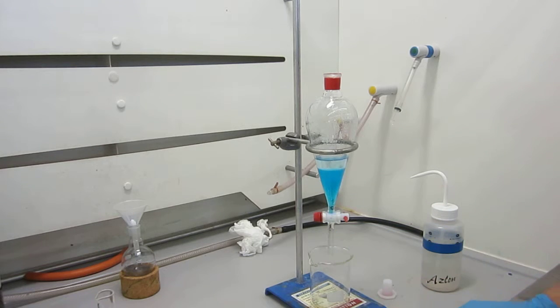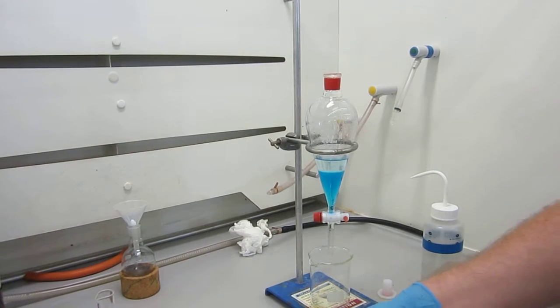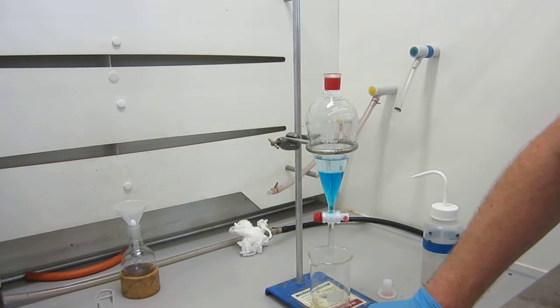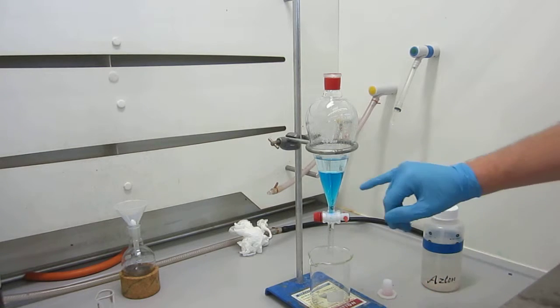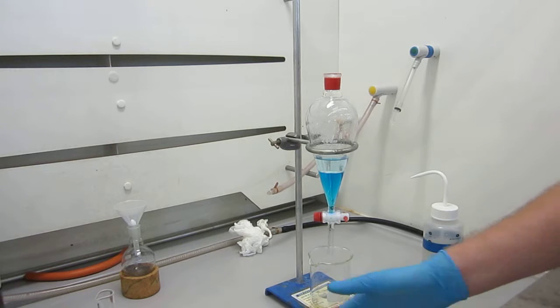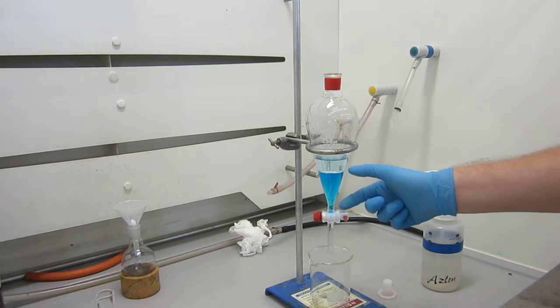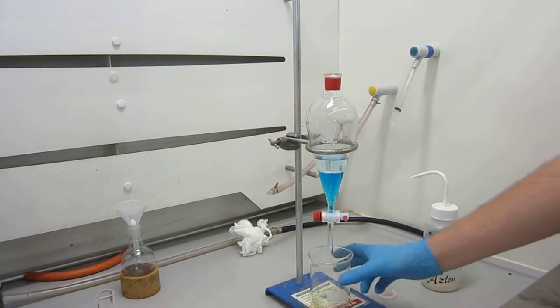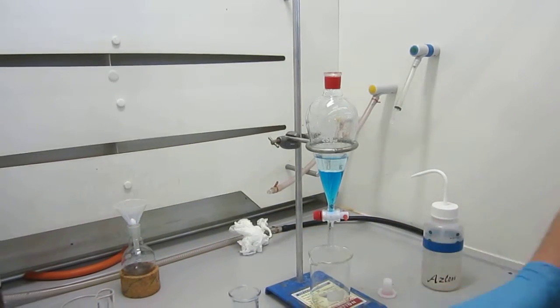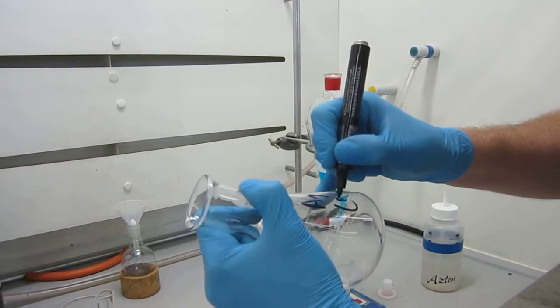Right. So the next part is running through the layers. So you need to know which layer you need to collect. I know that my ethyl acetate has a density of about 0.9 grams per mil, and water has a density of about 1 gram per mil. Because of that, the most dense one is going to be on the bottom, so my bottom layer should be the water layer. So the water layer should have my product in. So what I'm going to do is get a conical flask, because that's what I'm choosing to use. I'm going to write on it aqueous, in brackets, product.